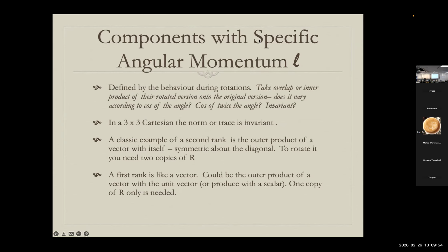we had just gotten to the point of saying the smart way is not Cartesian. The smart way, am I in the right spot? Yeah. The smart way is not Cartesian. The smart way is to decompose your matrix, whatever it is, whether it's simple like the dipolar or kind of cluttered like CSA. You're going to decompose it into angular momentum components, and those are what you're going to rotate. It sounds like complicating things, but you'll see that it's an elegant simplification.